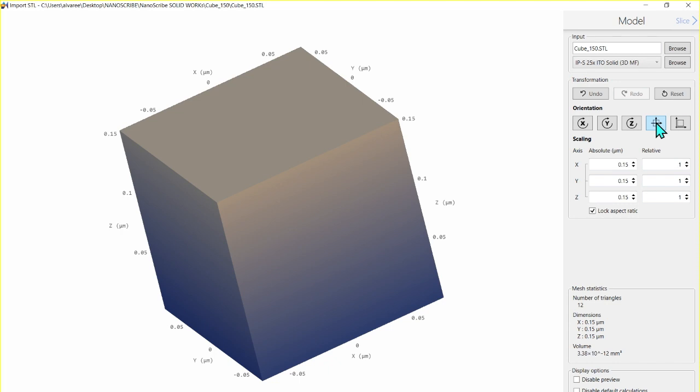I put this again in the center, and you have here important dimensions, because the volume is one detail that you will need if you are using the printing selector from the NanoGuide web page. So this is the volume of your structure, and this is one of the dimensions that is asked for in the printing selector that I mentioned in the first training part.